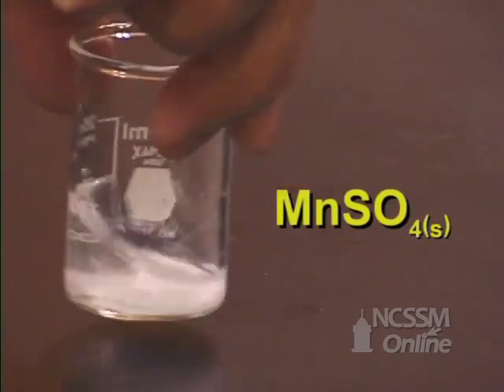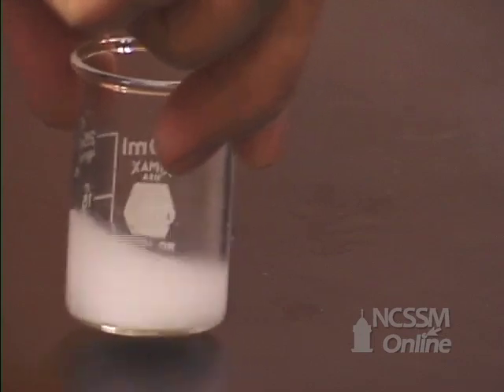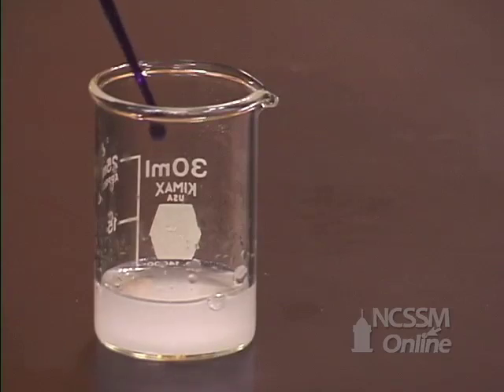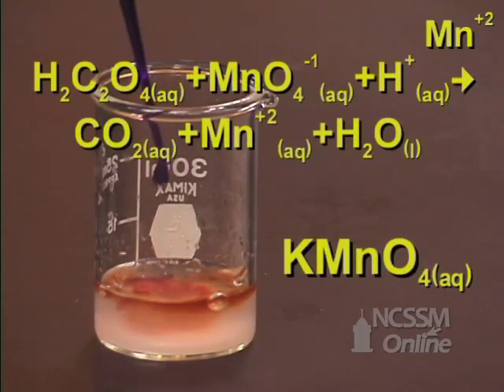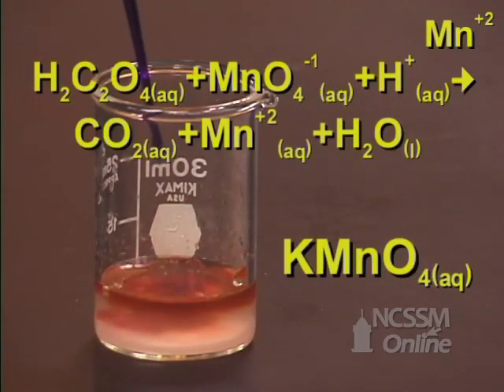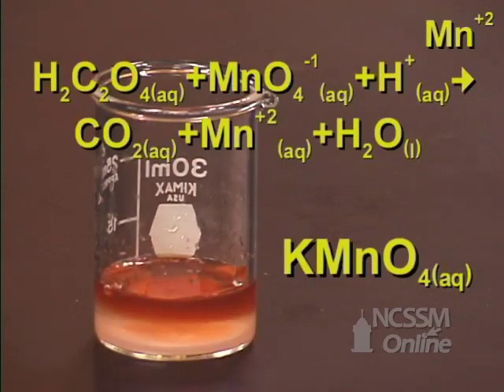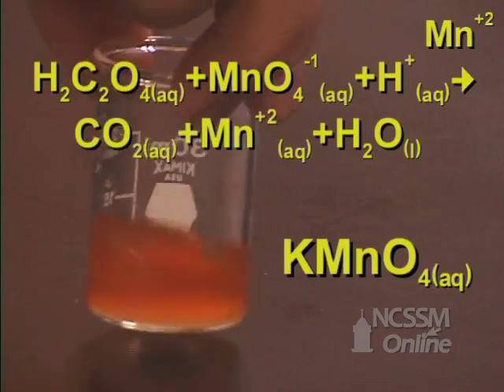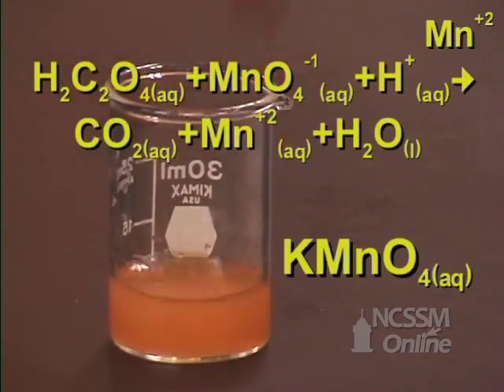The manganese sulfate acts as a catalyst for the reaction. We will now add some potassium permanganate. We notice that the reaction is relatively rapid compared to the reaction between the oxalic acid and permanganate at room temperature. The catalyst speeds up the rate of the reaction.